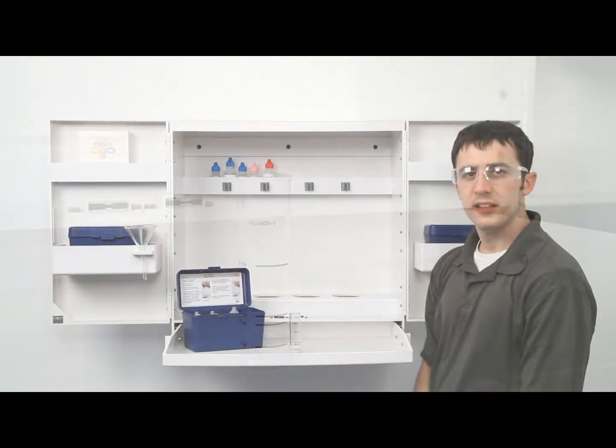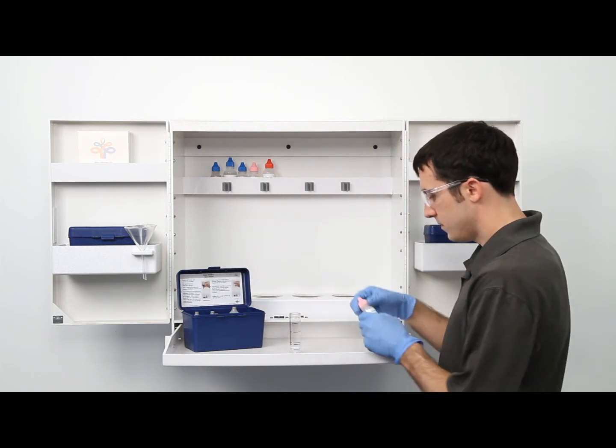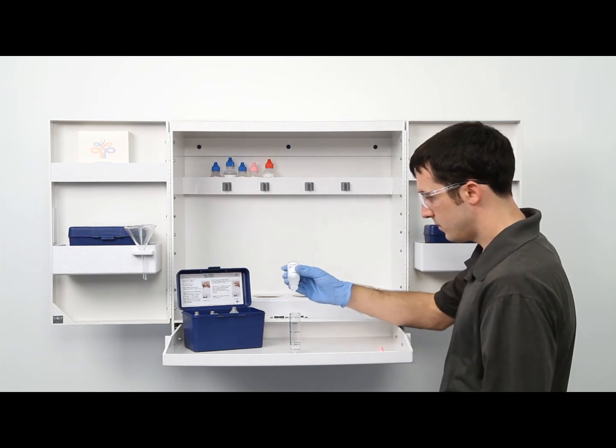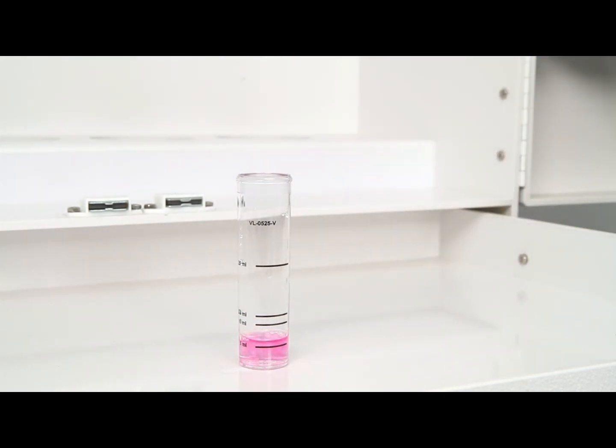The next step according to the endpoint ID procedure is to add 3 drops of phenolphthalein indicator. Be sure to hold the bottle vertically to get a consistent drop size. After the addition of each reagent, remember to swirl the vial to make sure the reagents are properly mixed.